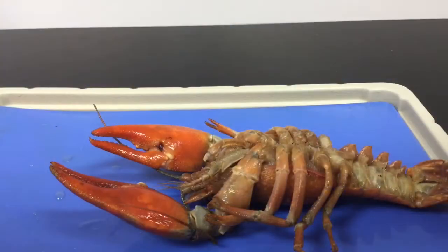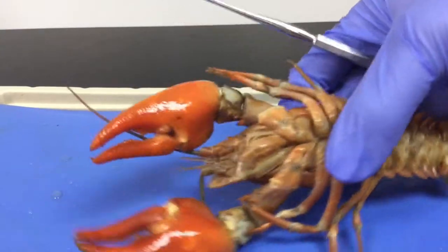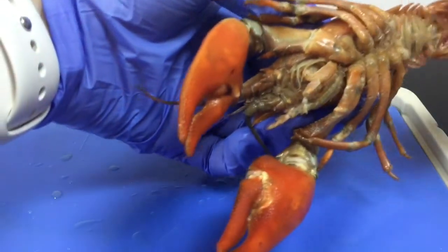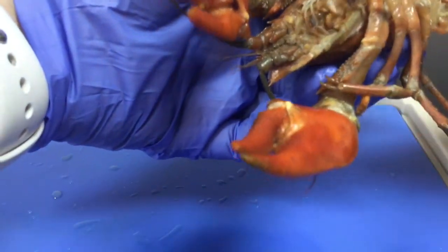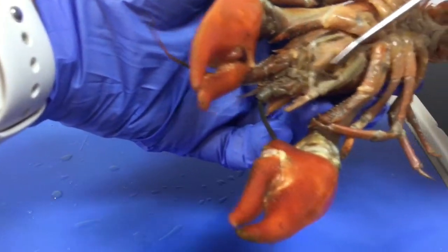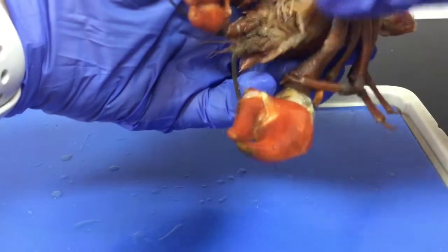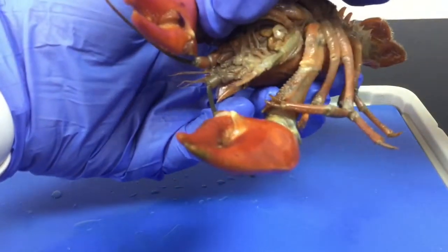So we're going to look at the other structures here, the mouth parts. It's kind of gross looking. I know, Susanna, you're loving this. These large pieces, they're actually pretty hard if you're able to feel them. These are the maxillipeds. I'm going to show you a picture in the book as well.